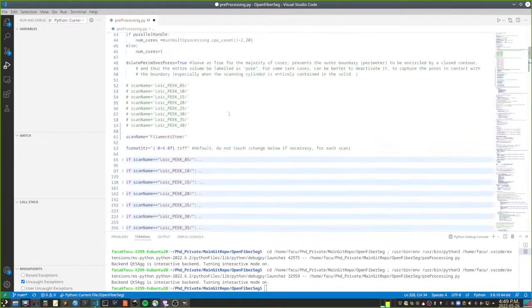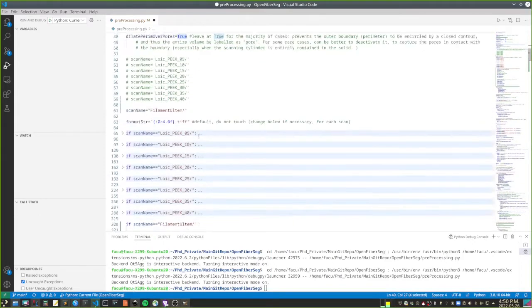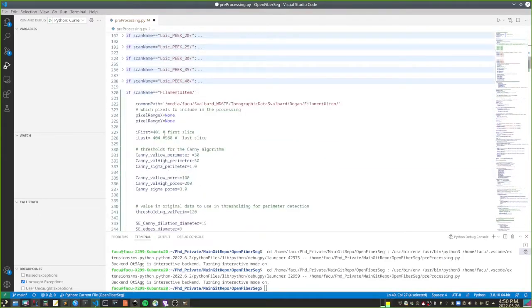Now I put this all to true. This one means I do it in parallel, like I send every slice to a different CPU core, and it runs simultaneously. It goes faster that way, but you have to be aware that there are many processes, many threads at once. And this one, you can put it at false if you don't want to save anything, but usually I just leave it on and I remember to only consider the data when it's the full stack that I want.